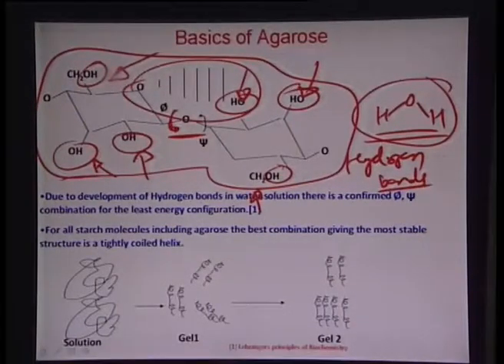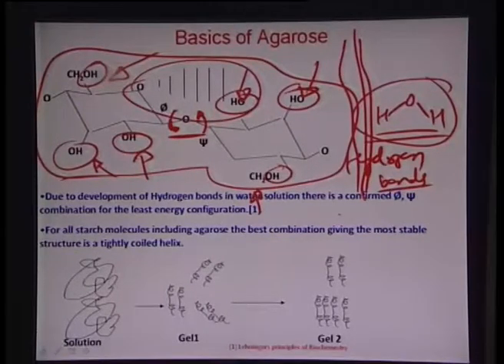You visualize it from this end, and because of this rotation of the molecules, and several such centers being developed, we develop molecular coils, and these coils are essentially what comprise the pores of the gel materials. You can see here in this figure.